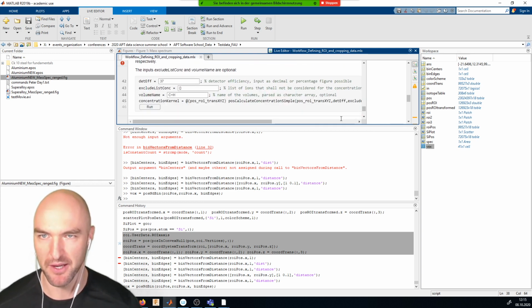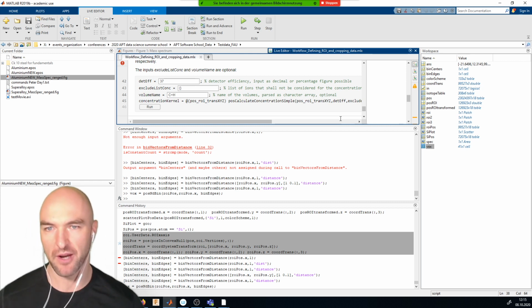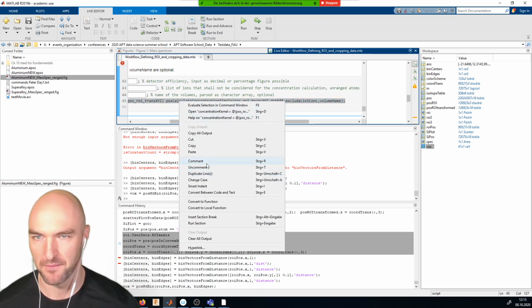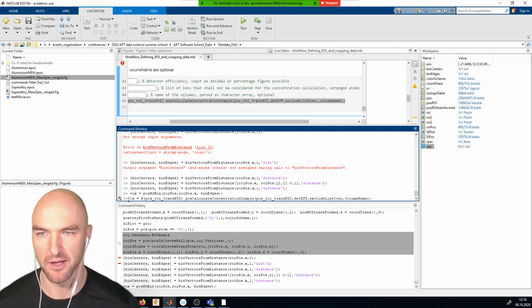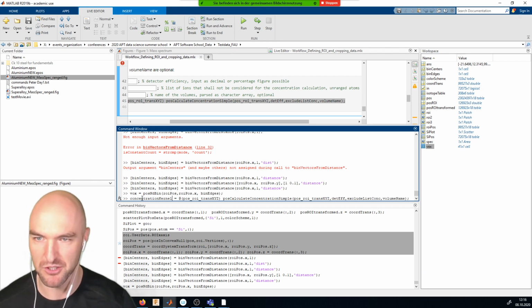The next thing we do is something that I already showed you yesterday, and it is creating a concentration kernel. The concentration kernel is essentially a function that calculates the concentration for each of those sub-POS files. Yeah? So I can go into here and do the same thing that I essentially did yesterday, just now we're calling it concentration kernel. I very often abbreviate it as CK, but I kept saying you shouldn't do that, so maybe I shouldn't do that either. Let's keep it as concentration kernel.